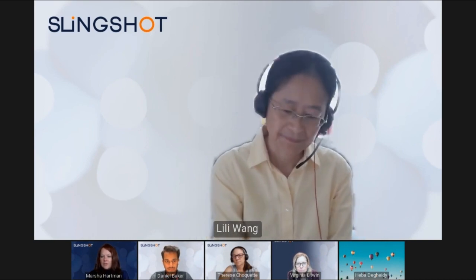Yeah, thank you for that answer. And Virginia, as I send it over to you, I'm just going to bring up the point that cell therapy has certainly elevated the need for flow cytometry in analytical development and the late-stage manufacturing process of drug development. But as you've alluded to previously, flow cytometry has been part of drug development for decades, well over 2 decades, and has been really integral in setting up any biologic drug and other therapies.